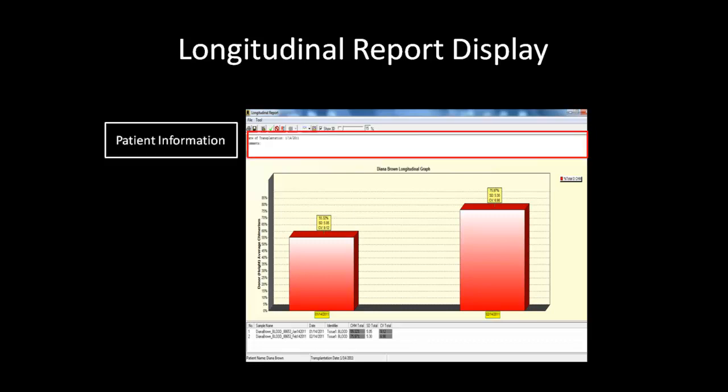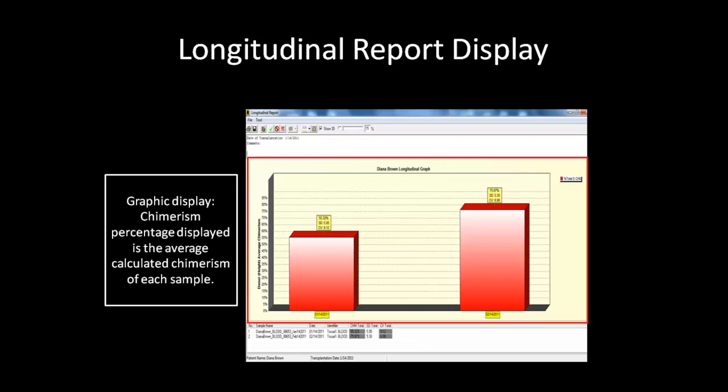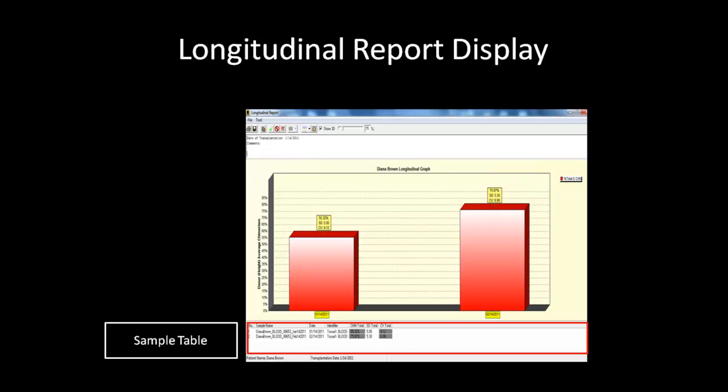The report will populate with the two samples selected. The top pane displays the patient information and any comments you may have. The middle pane shows a bar graph relative to the average chimerism of each sample. The table at the bottom contains a list of all samples currently in the project along with a few parameters. You can choose which columns to show or hide by right-clicking on the table and selecting the desired options.